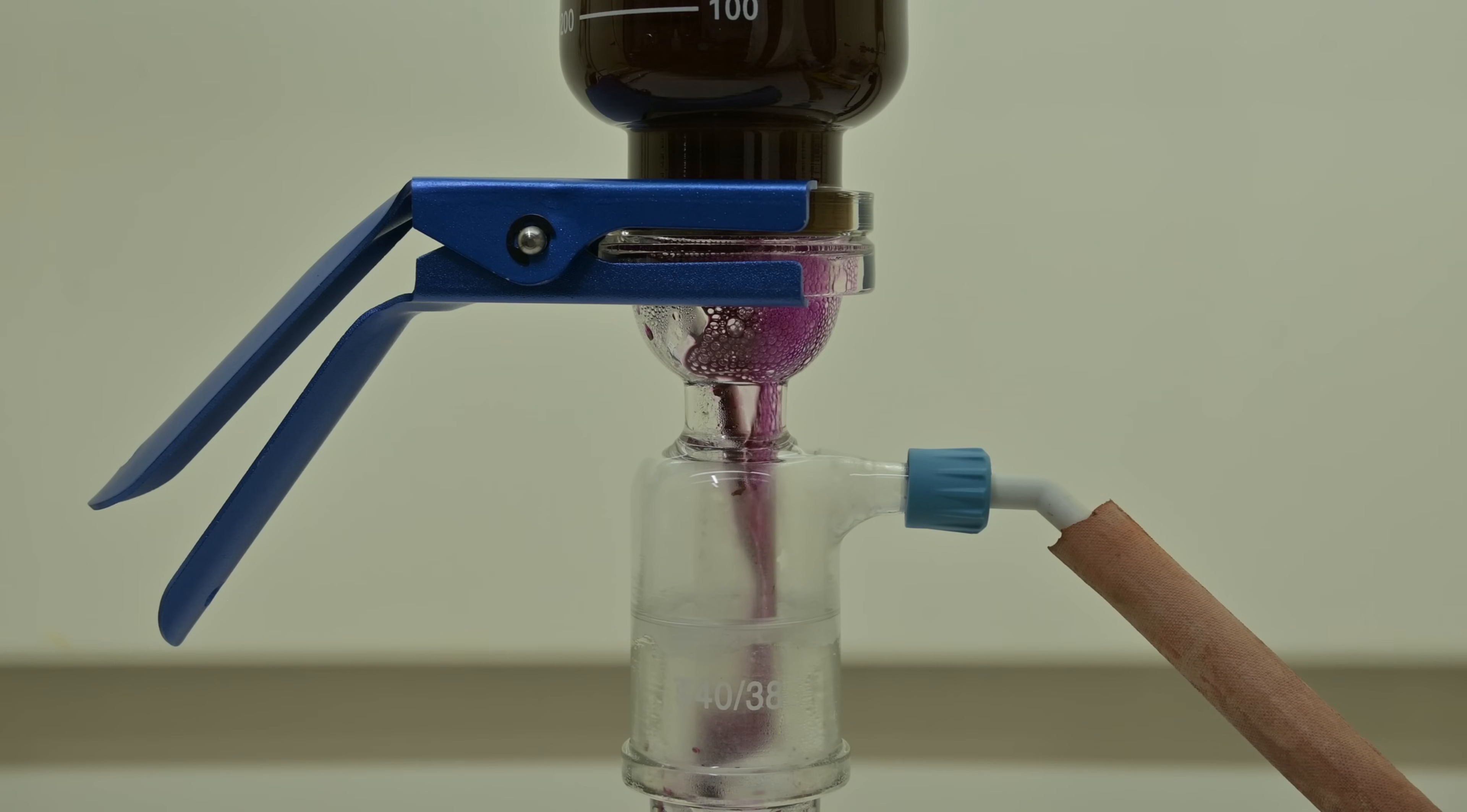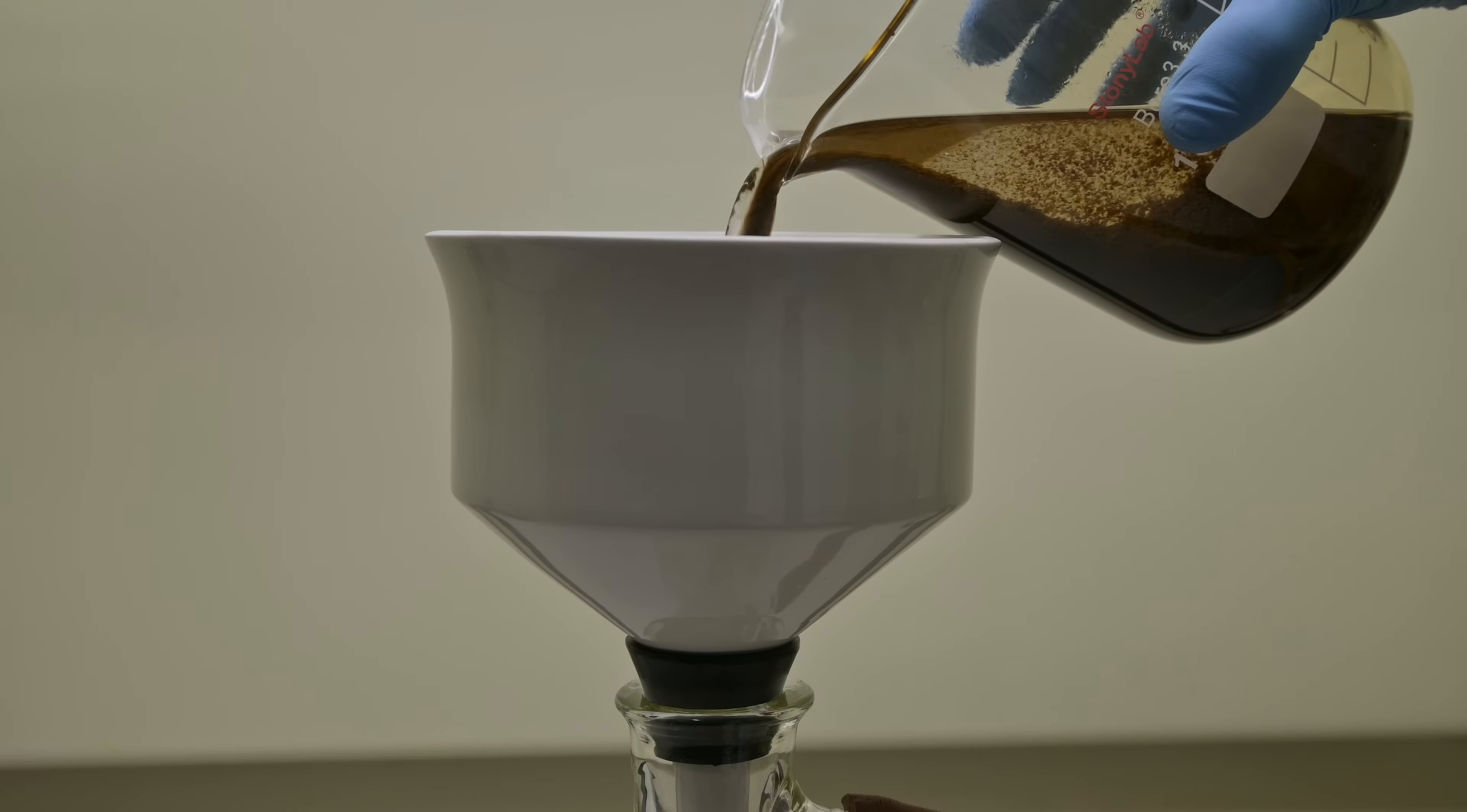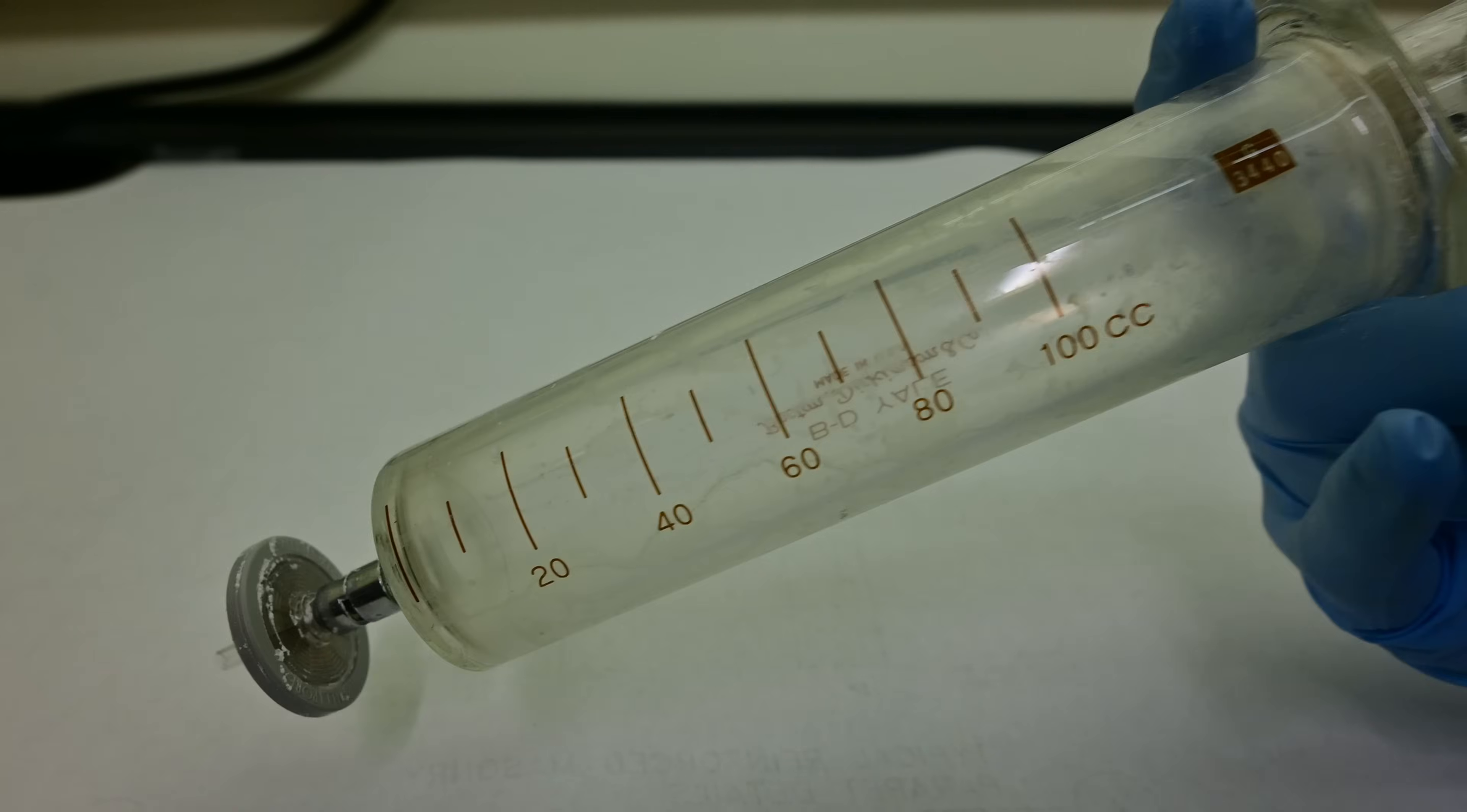If the filtrate is still purple, this means that there is some unreacted permanganate left. To fix this, I add about 6 mL of ethanol and boil the solution briefly. Ethanol reduces any leftover permanganate without harming our desired product. I then filter through fresh filter paper to remove any newly formed manganese dioxide. The filter paper wasn't getting all the dioxide out, so I used a 0.45 micron syringe filter to make sure it's all out.